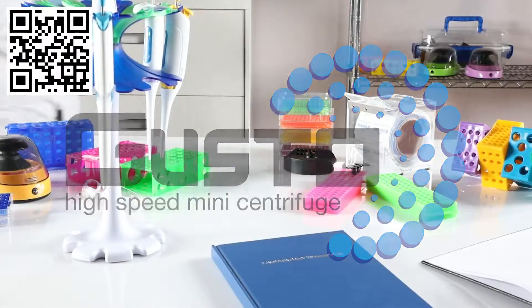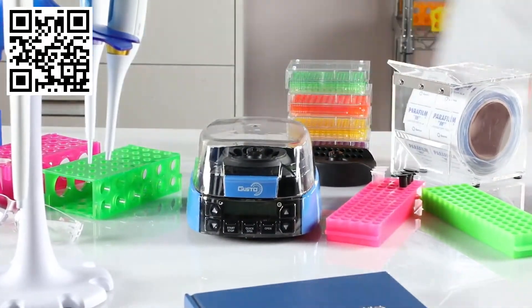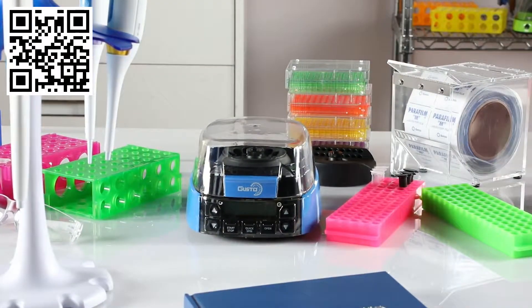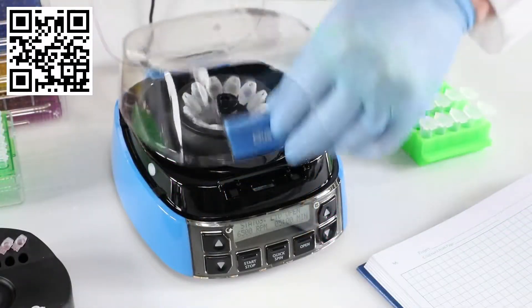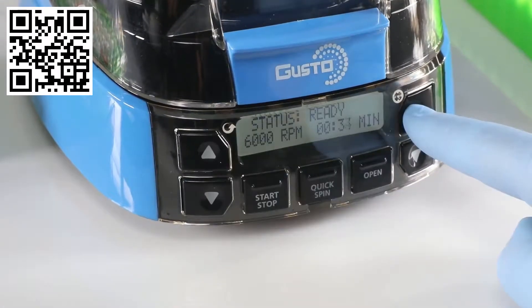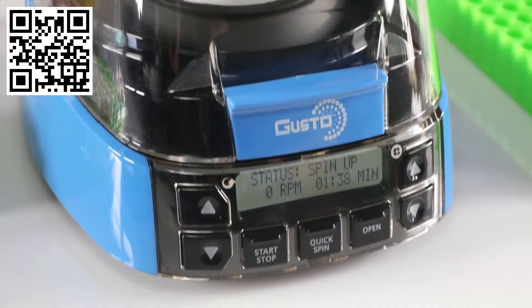Maximum speed, minimal space — that's what makes the Gusto high-speed mini centrifuge the perfect choice for any sized workstation. To operate, just insert your tubes, close the lid, adjust the speed and time, and then press start.